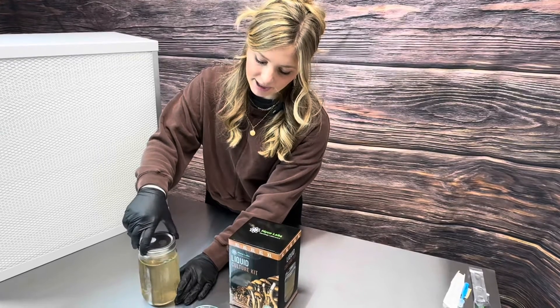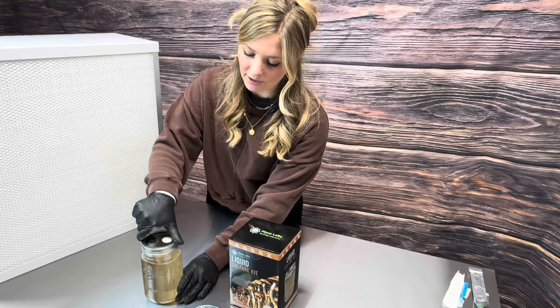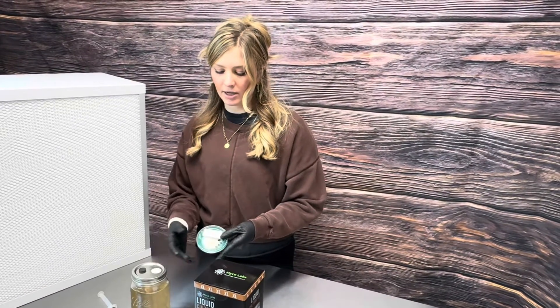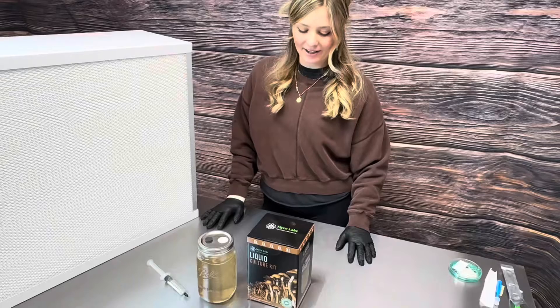After adding the cordyceps agar punches, it will take two to three weeks for mycelium to start developing in your liquid culture jar. We always recommend using an agar plate because that way you can see that you have clean growth — sometimes spore syringes may have contaminants which will contaminate your liquid culture. Always test your liquid culture on an agar plate first to make sure you don't have any contaminants before inoculating your substrate.